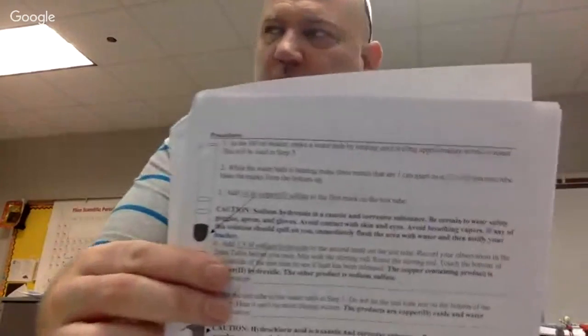Now, the products, we have not done reactions yet, but if you flip back to the previous page, let's read together. I'm going to share a couple things with you. So first of all, and we're right here at the top of the second page, it says, in a 100 milliliter beaker, make a water bath by heating until boiling approximately 60 milliliters of water.